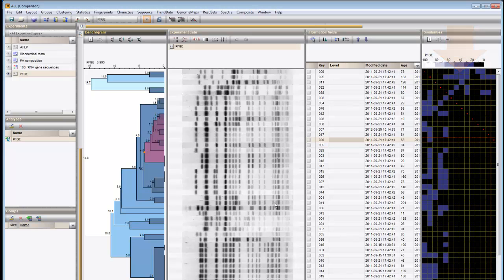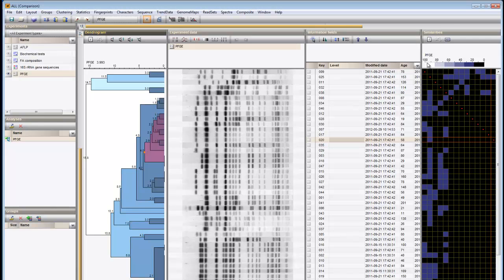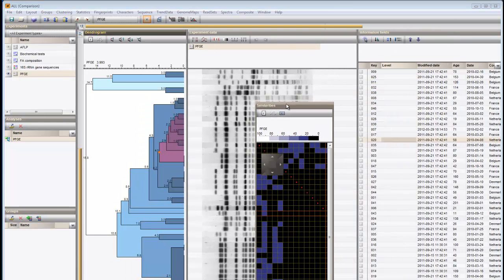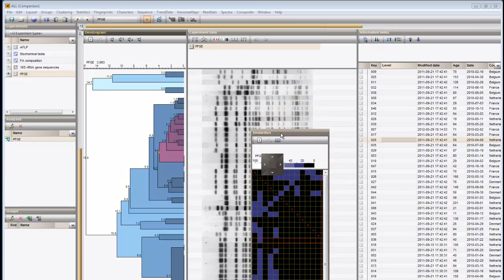To display all panels next to each other, it is obvious that a high-resolution screen is helpful. However, it is also possible to dock panels so that they become overlapping tabs. For example, I will re-dock the matrix panel so that it becomes a tab in the image panel. I drag the panel to the image panel and I release it in the center of the square.